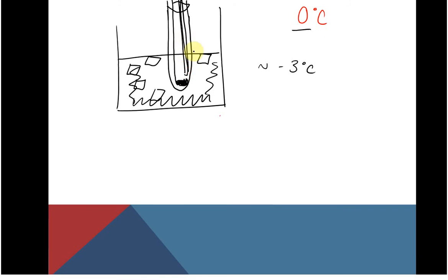Now, in your diagram on the lab, it also shows that you're supposed to be able to have this all capped up. And to be entirely honest, this stopper probably won't fit. Okay, so just kind of be aware of that. Now, you're going to have this guy clamped to your ring stand, so that you don't have to really spend a lot of time holding it. And you're going to add about 12 milliliters of water. And you're going to put it in here.